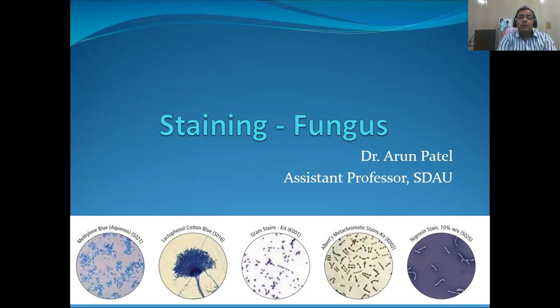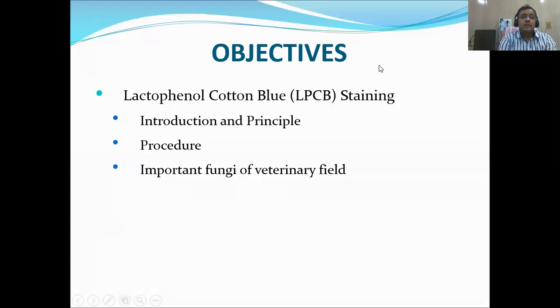The objective of today's class is that we will discuss in depth lactophenol cotton blue, abbreviated as LPCB staining, which is generally used to stain fungi. In exams, a question may sometimes ask which stain is commonly used to stain fungi.